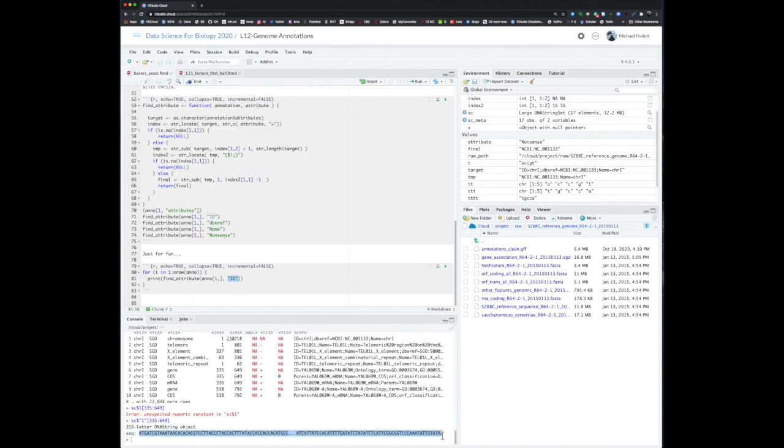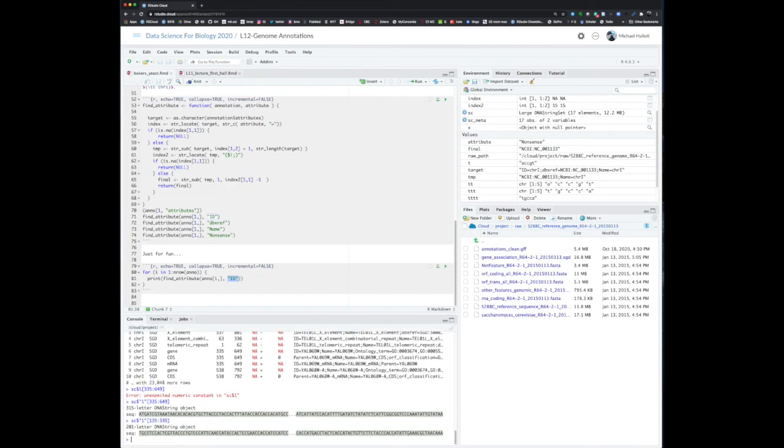And now we could do all sorts of interesting analysis. We could ask for the promoter region, let's say maybe 200 base pairs upstream of that gene. And we could then say, instead of from 335, maybe 135 to 335, and that should be the promoter for that gene, right?